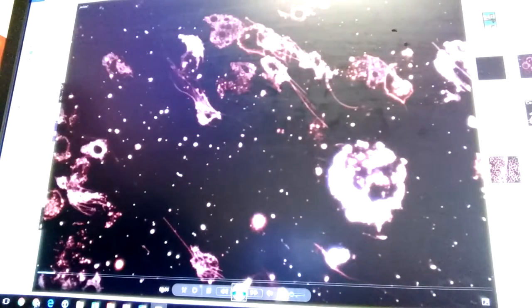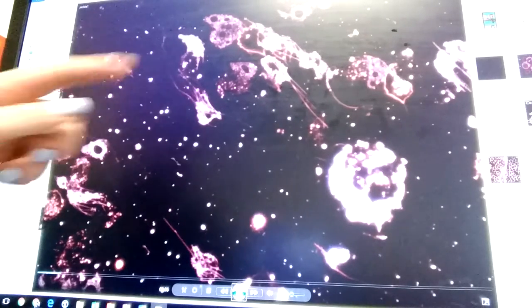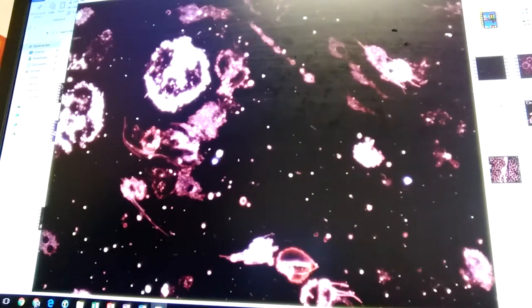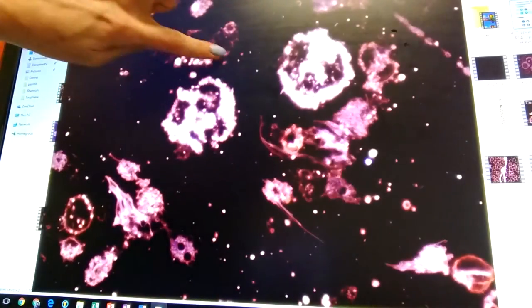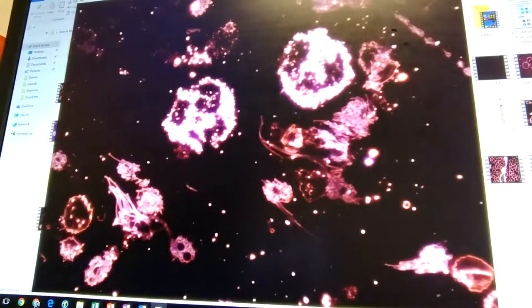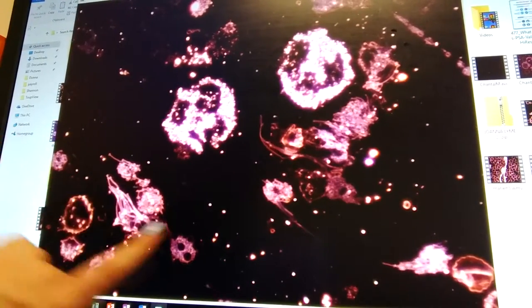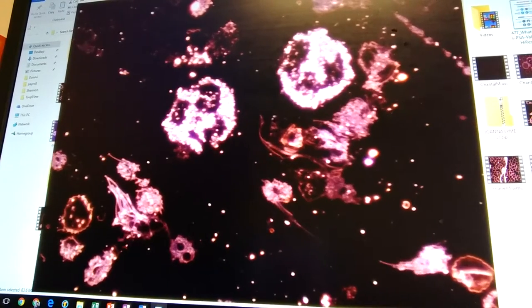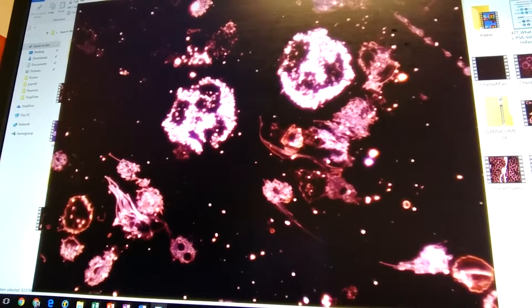Basically, what we have here is a whole bunch of parasites you're seeing on screen. So here's quite a long bacterial strand. Now, there's another little parasite in the corner here. Regarding the ticks, unfortunately, because they bite animals and they live in the soil, they carry an enormous amount of different types of parasites and bacteria. These big white blobs that you're seeing here is your immune system. In this particular case, the immune system is overwhelmed with all of the different parasites and bacteria here. Therefore, it's not active and moving.